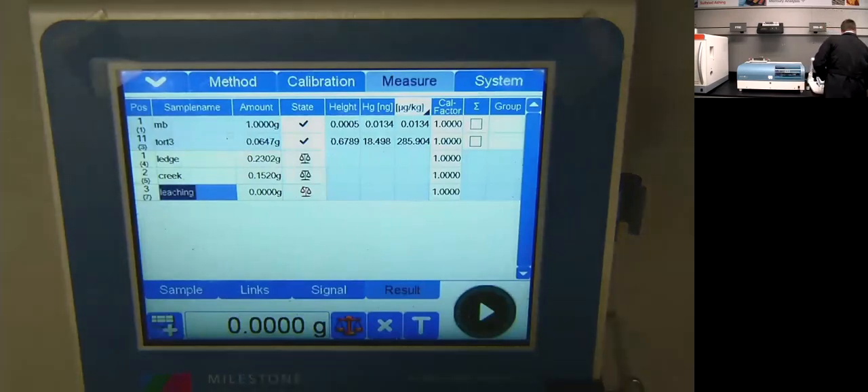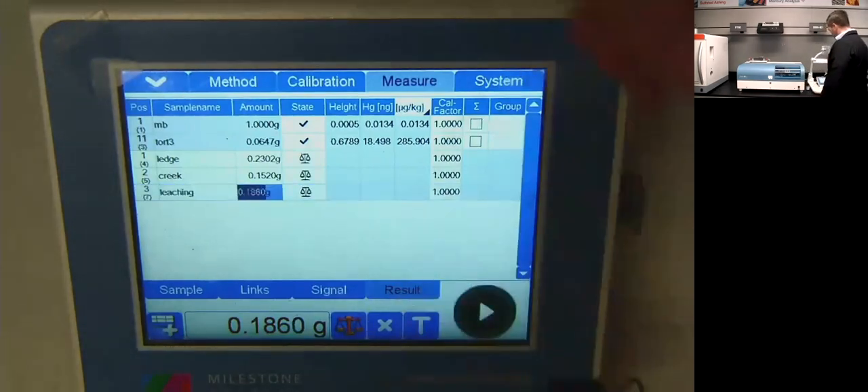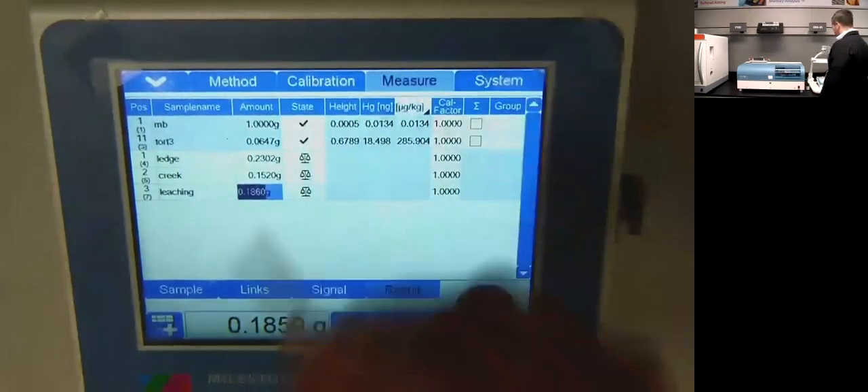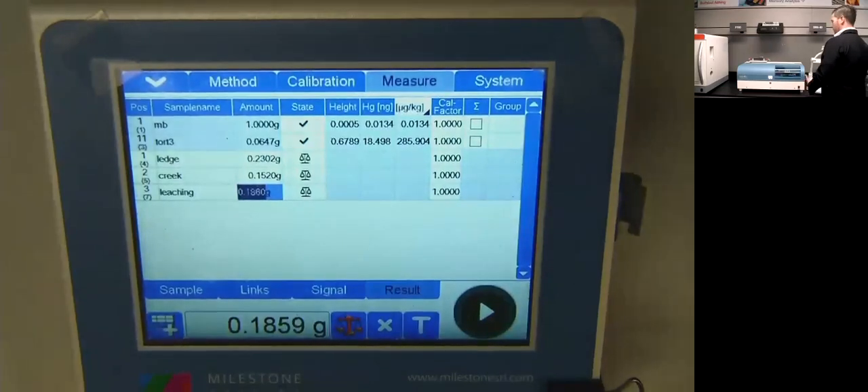I'm going to weigh out about 100 milligrams. It doesn't have to be exact. The soil is a little moist — I didn't dry these; they're as-is analysis. Obviously I'm not doing a real research project on mercury levels in my backyard soil, just more of a proof of concept to show you how easy it is to run your DMA. I've got 186 milligrams. I'm going to close the door and click that scale button, which ports the weight directly into my sample table. You can also manually enter weights, but that can lead to transcription errors.